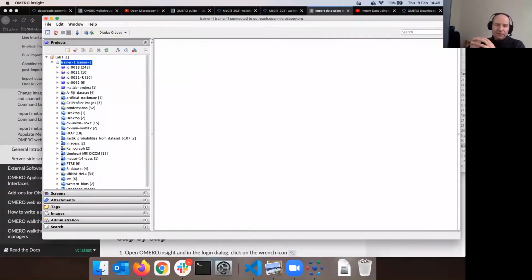But just keep trying, and always remember what is the answer. Like failed to log in because what? The server not responding might possibly also be a reaction to a choppy internet connection on your side, I am afraid, because a lot of people managed to connect.